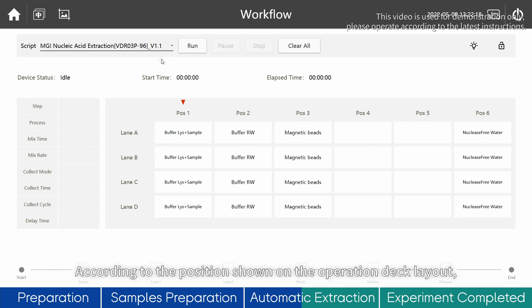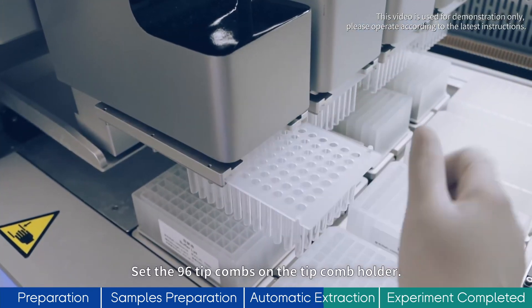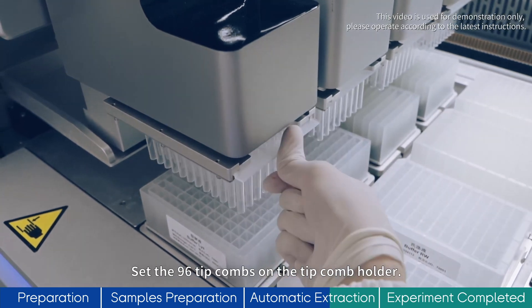According to the position shown on the operation deck layout, place each extraction reagent plate in the instrument. Set the 96 tip combs on the tip comb holder.